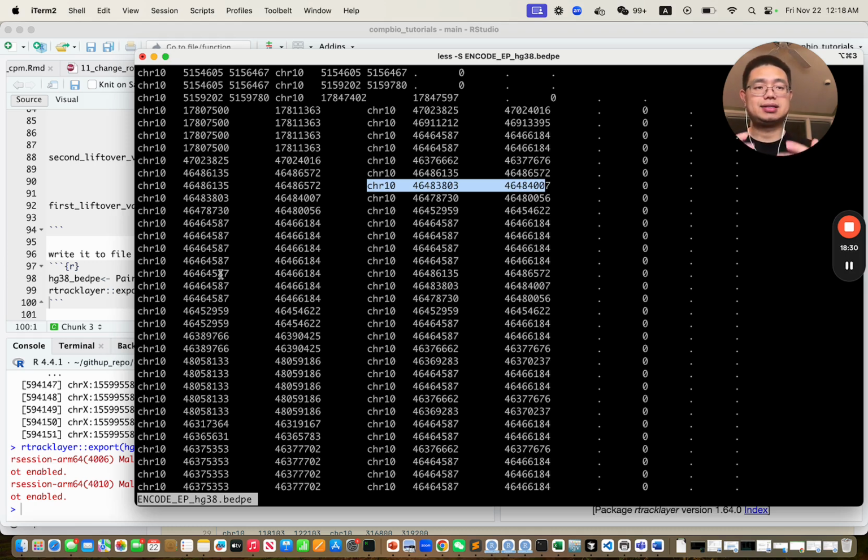Okay, as you can see, this is a little bit complicated even for such an easy task. Of course, you can always search online on Google and find, okay, there's a Python solution for this, also using the UCSC utility tool liftOver to do a similar task.